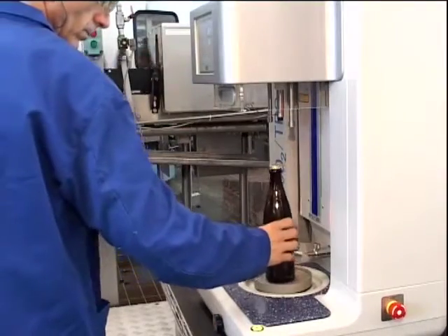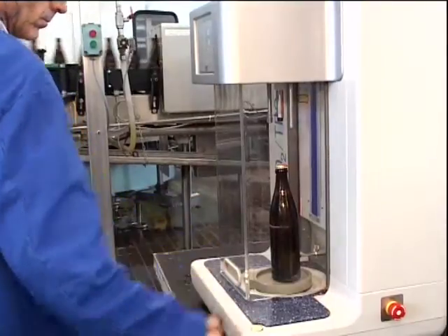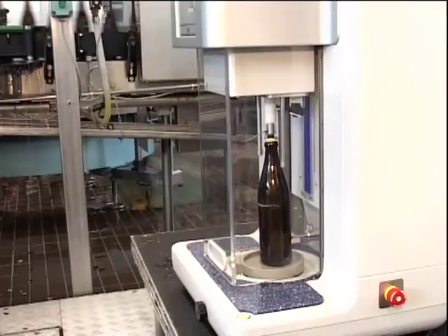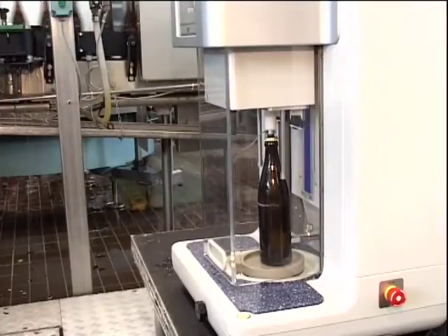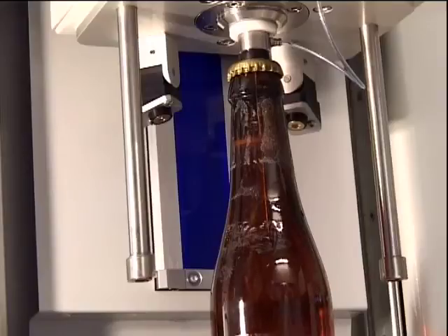The Orbisphere 6110 provides a rapid return on investment as a result of having the lowest total cost of ownership. Its robust and innovative design minimizes preparation, calibration, validation, and cleaning to maximize system reliability and uptime.